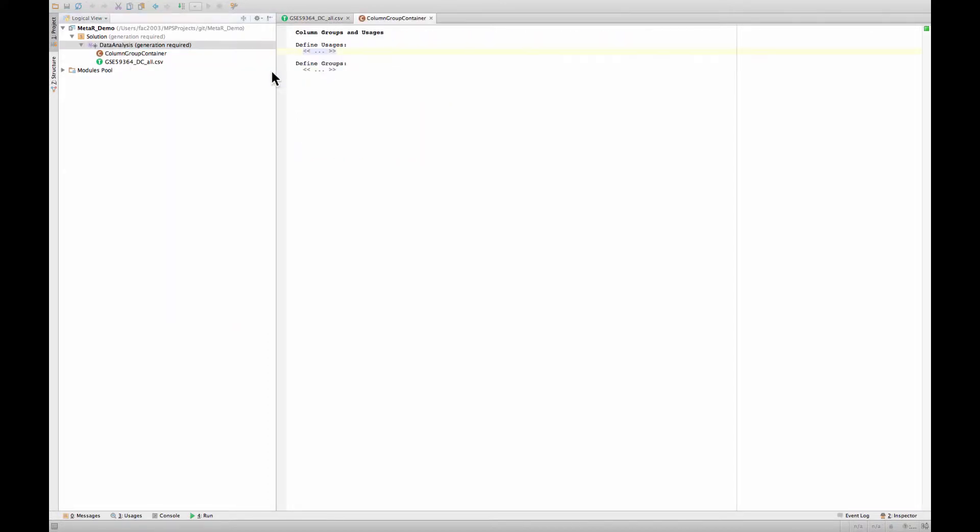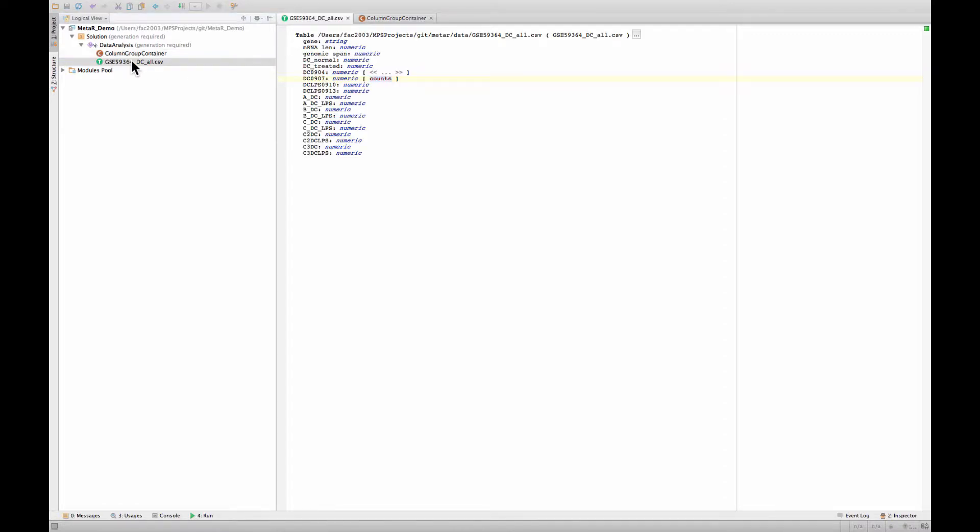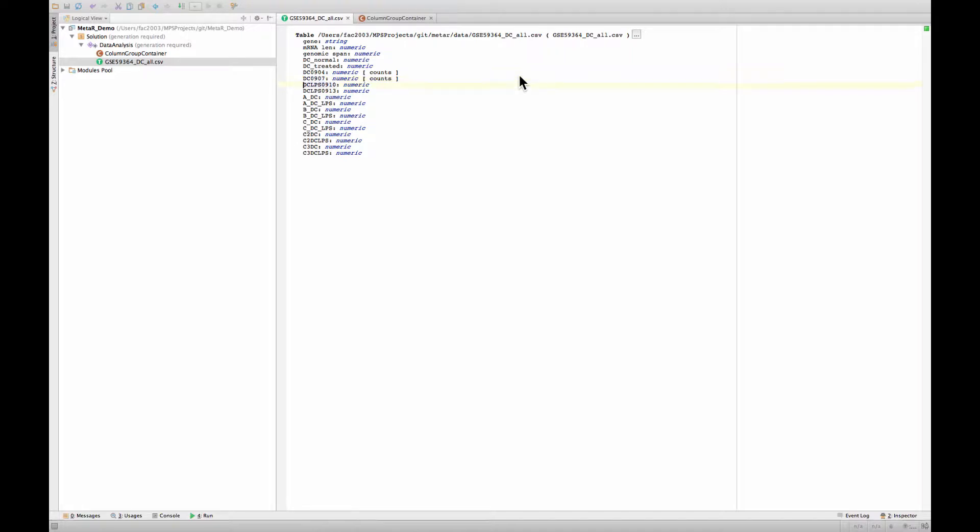So the way to work around this is to first define a column group container in the same model. And now that I do that, I can actually press return under groups and I can type counts. If I go back to this table, the counts now is bound to the group. So I also get auto-completion, so I can actually decide that this one is also a count.